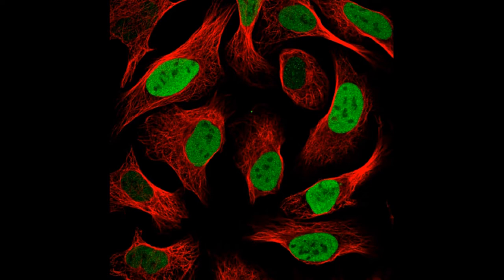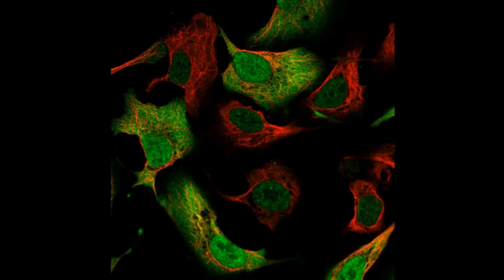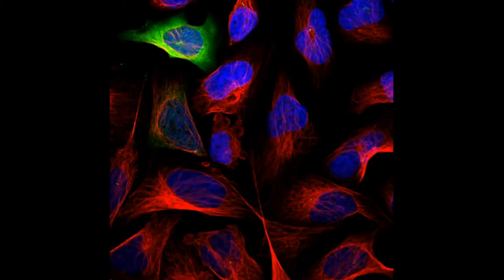In some images we can also see multilocalizing proteins where only one of the compartments varies. Here we can see the protein in the nucleus in all cells, whereas the cytoplasmic localization is only present in some cells. We can also see more distinct spatial variations. This might be hard to see, so you have to look closely. You can see that there's one cell that is expressing the protein in the cytoplasm at a high level, but then if you look closely, you can see that the protein is actually present in the centrosome in all other cells in this image too.